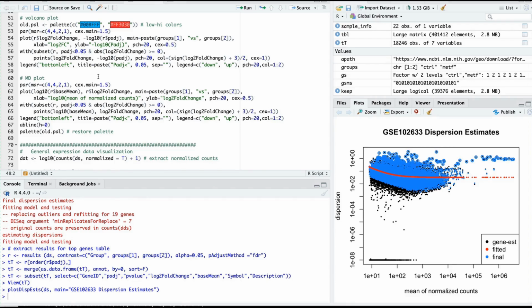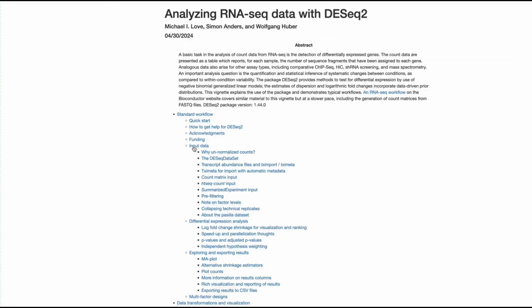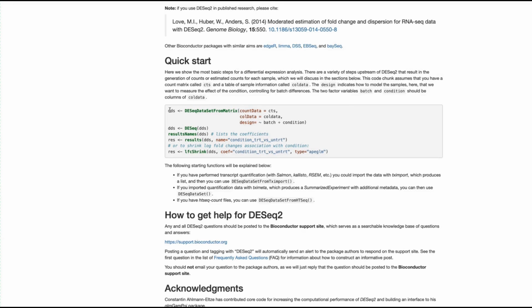And basically that's the minimal introduction to DESeq, how it works. A longer version can be found in the tutorial online, which is properly updated. Again, they repeat the message that the core of the DESeq2 protocol is very small.